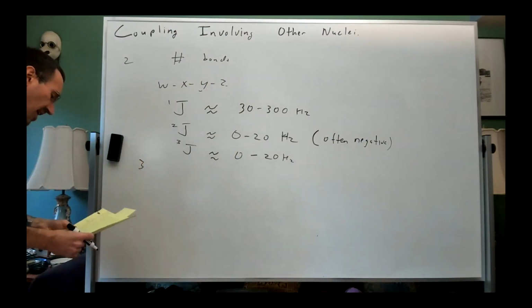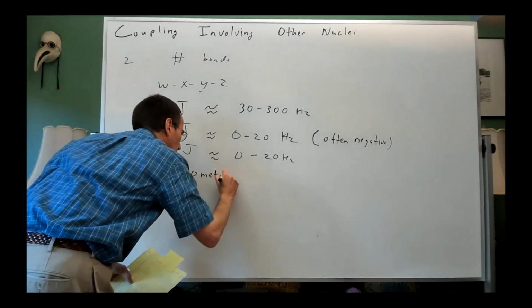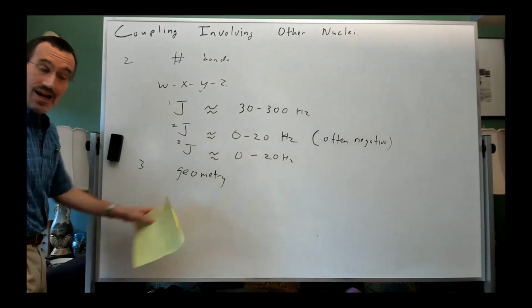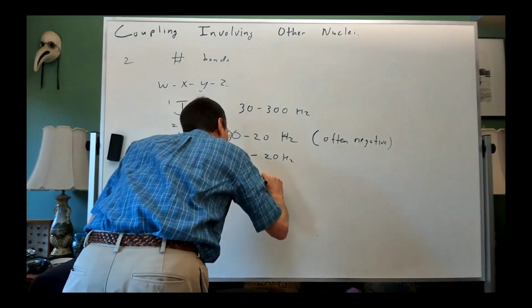Okay, so third factor I've already mentioned is geometry. And particularly, I'll put this in a finer point and say particularly dihedral angle.